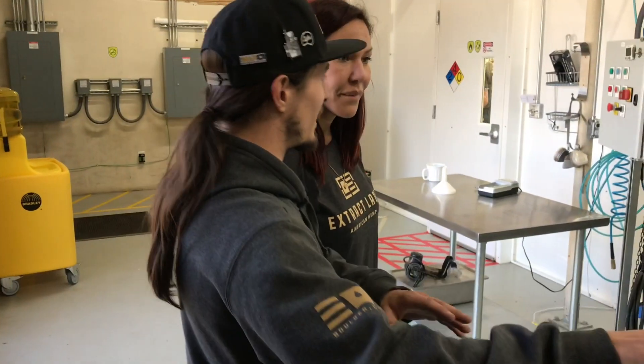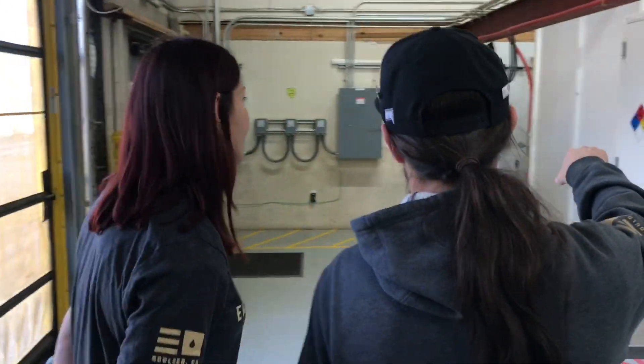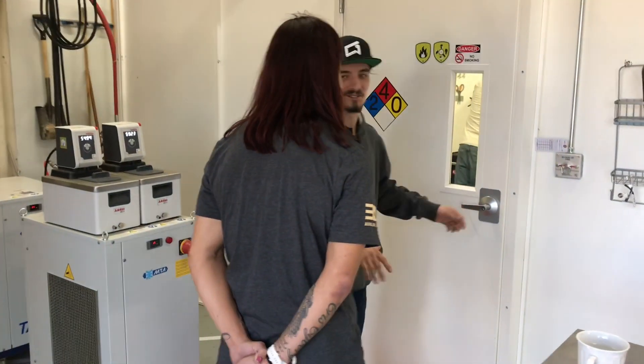This is a CO2 extractor right here. You've heard of propane — you cook with propane and everything. We can extract with it in here. It's another machine that kind of does it. But propane can be a little explosive, so we keep everything hidden.